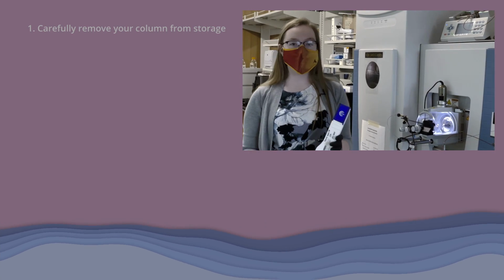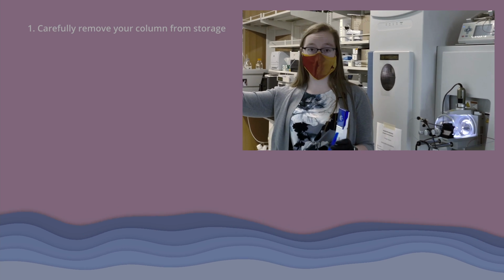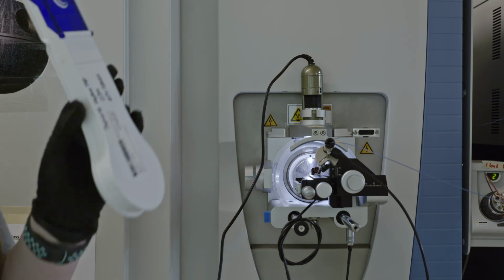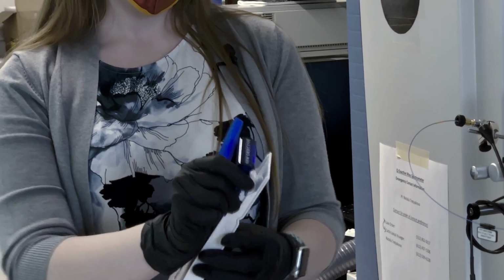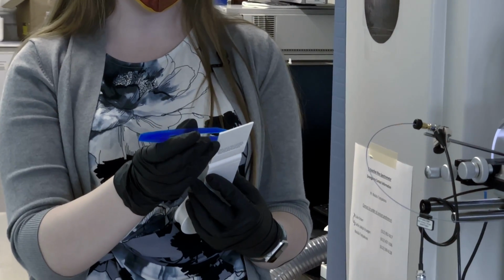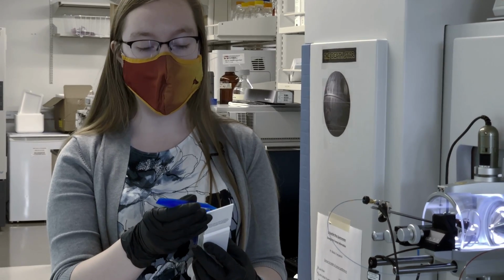So we have a couple of different storage systems for nano columns. You'll notice there are a few taped to the fume hood above me. Some we store in NMR tubes if they're short enough. And this is actually the packaging that the columns come in and where I currently have my columns stored. So to insert a nano column, you want to open up the package and very carefully with the plastic tweezers remove the column from the package without damaging the tip.